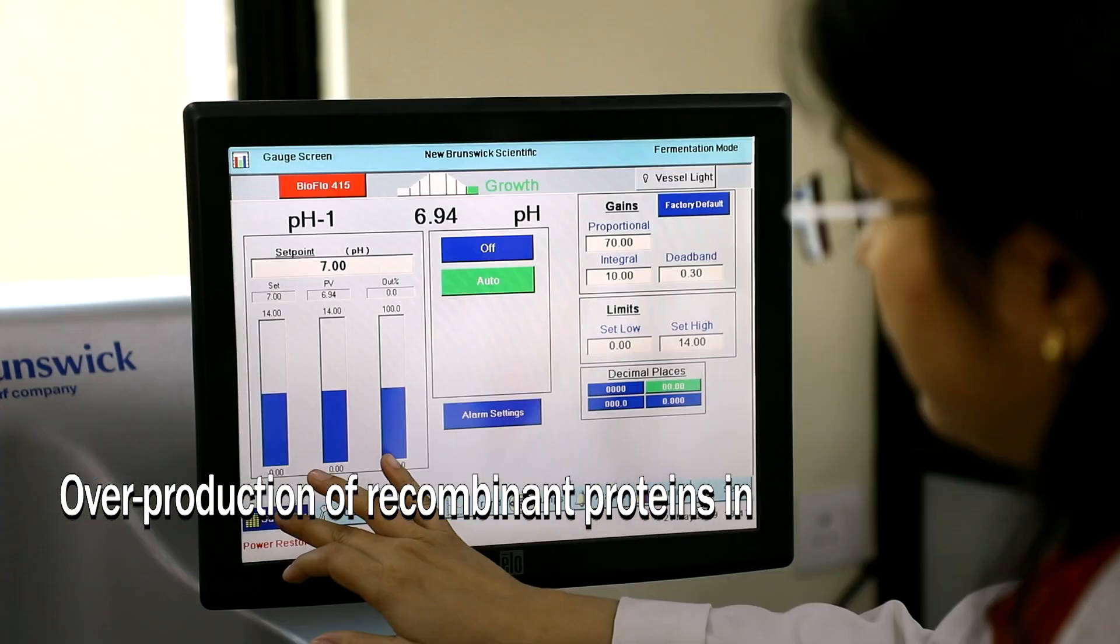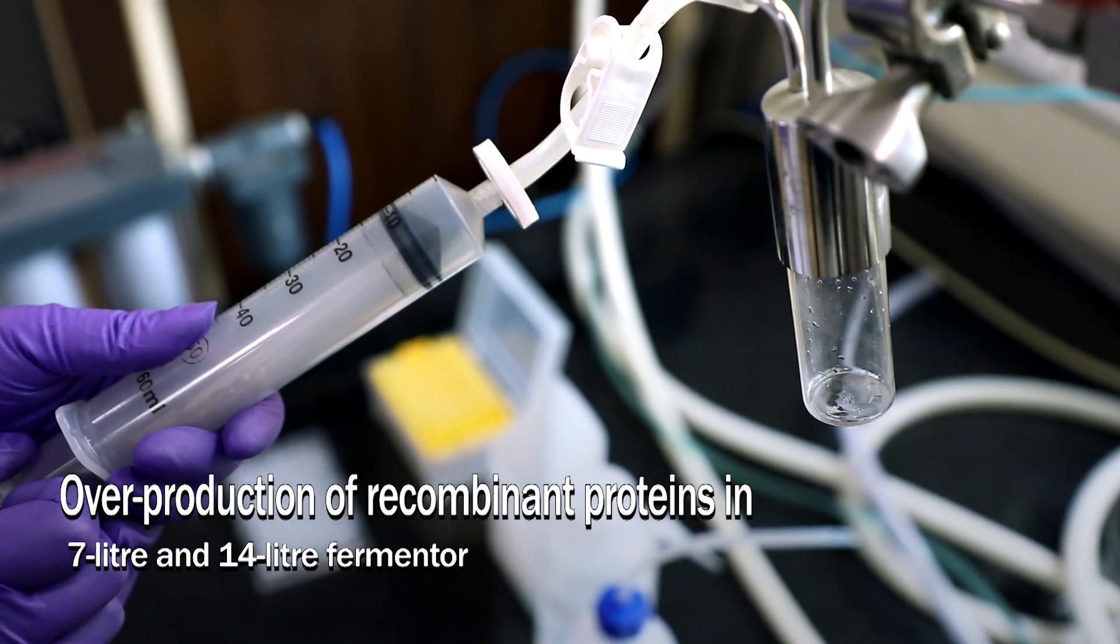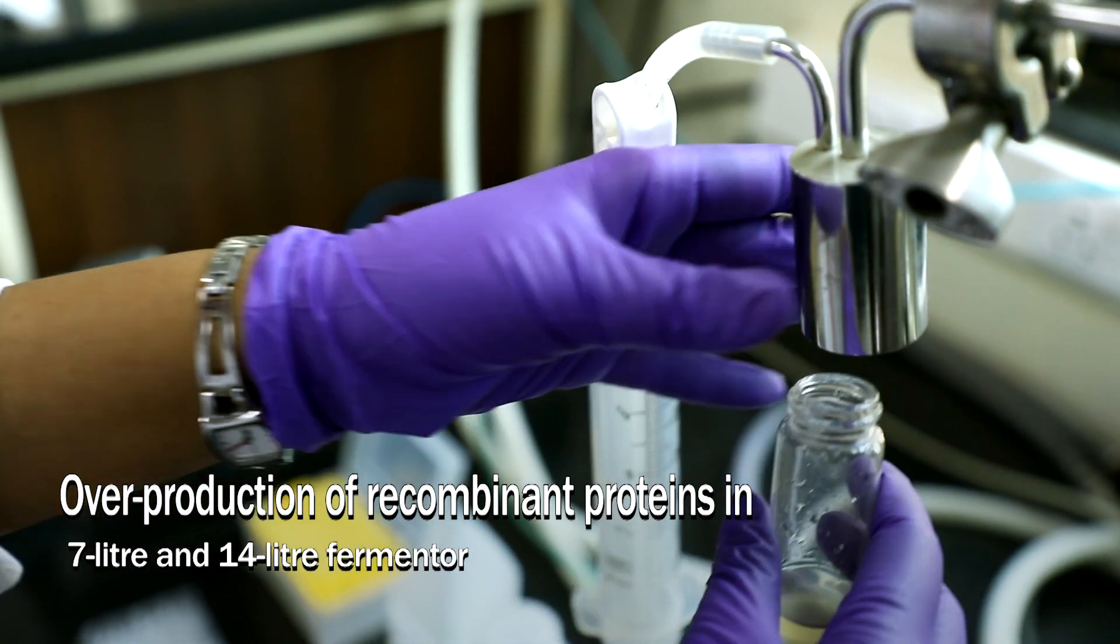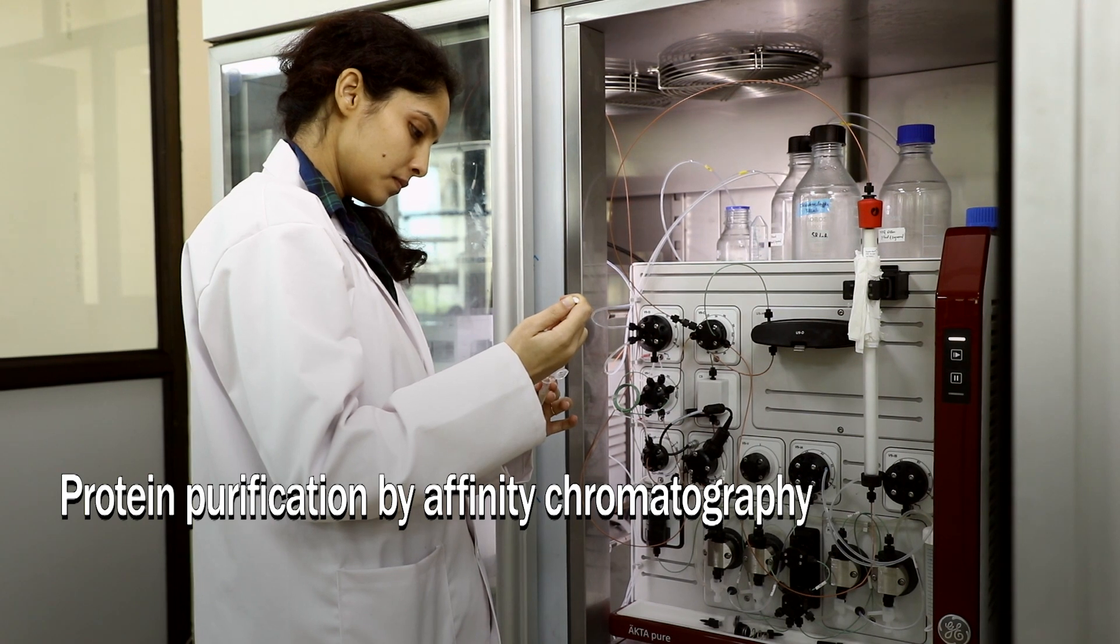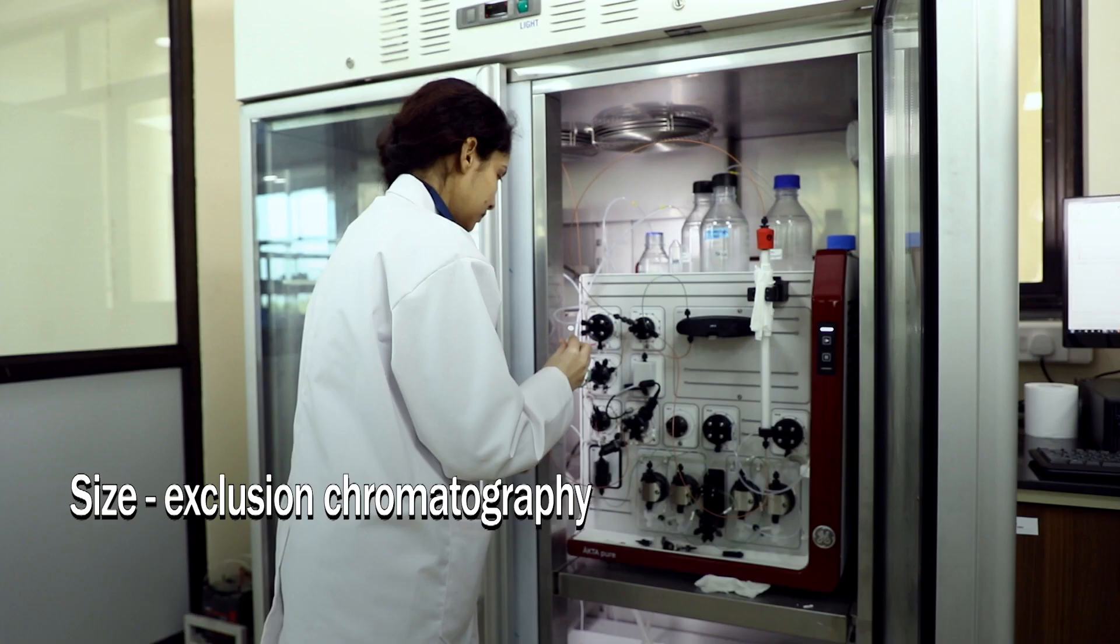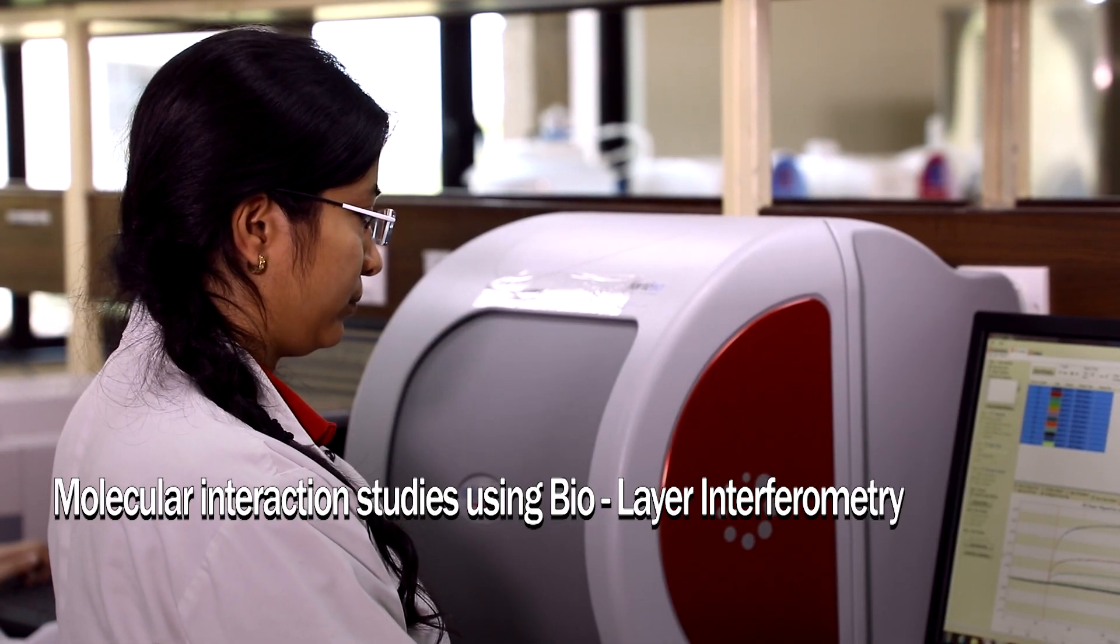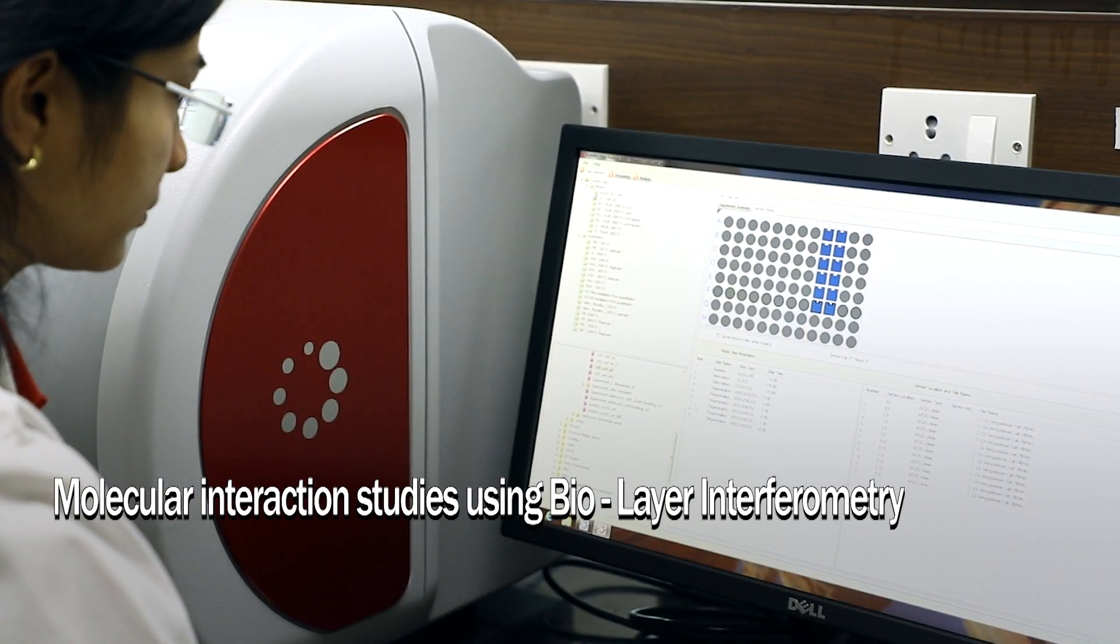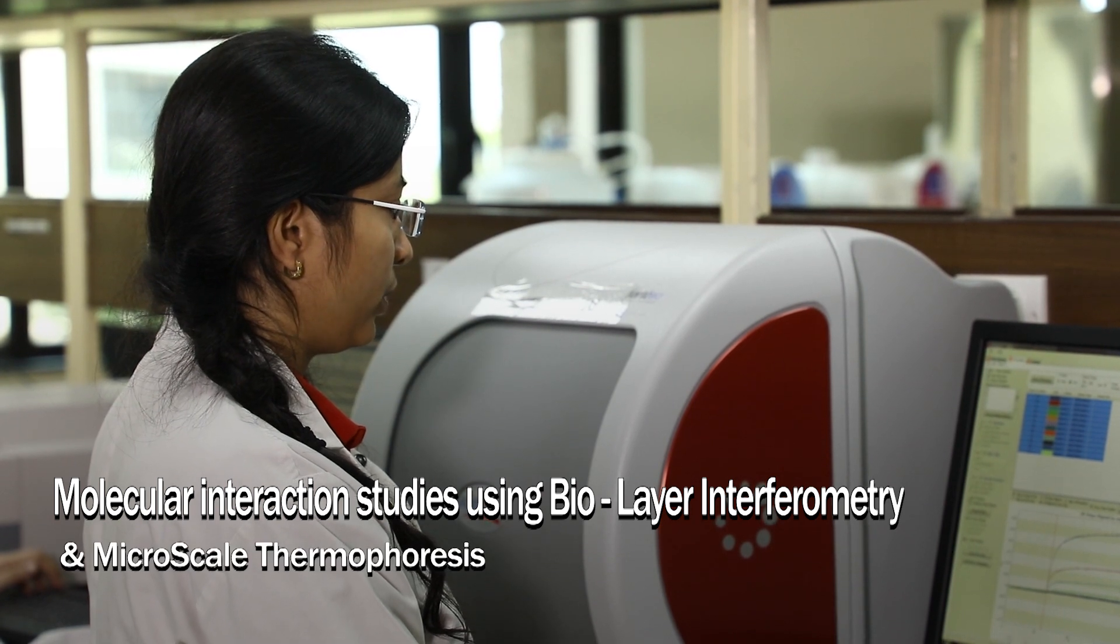Overproduction of recombinant proteins in 7-litre and 14-litre fermenter. Protein Purification by Affinity Chromatography and Size Exclusion Chromatography, Molecular Interaction Studies using BioLayer Interferometry and Microscale Thermophoresis.